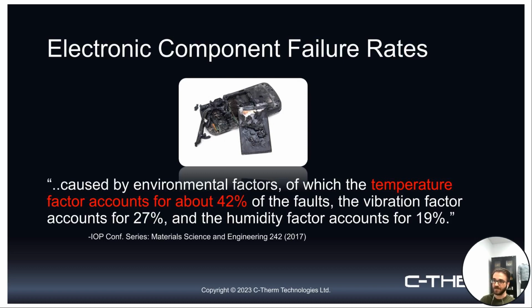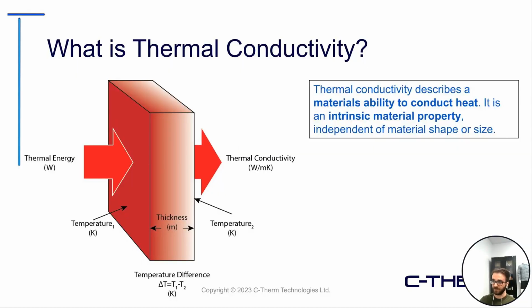from this 2017 conference. The idea here is that these materials being incorporated into some of these very small form factor systems are there to help alleviate some of that thermal stress that is generated. Now, how is this done, and what's really an important aspect to these materials is related primarily to the thermal conductivity.